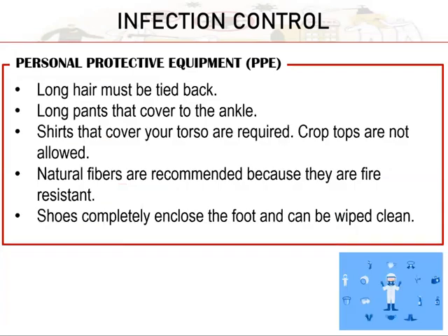Okay, other than the PPEs mentioned, these are the things that we must remember. Long hair must be tied back. Another one, long pants that cover to the ankle. As I have mentioned, there should be no skin exposed when we are in the laboratory. Shirts that cover the torso. It is not appropriate if the laboratory uniform is a crop top. And we have the recommended fiber for the lab gowns, and shoes that completely enclose the foot.